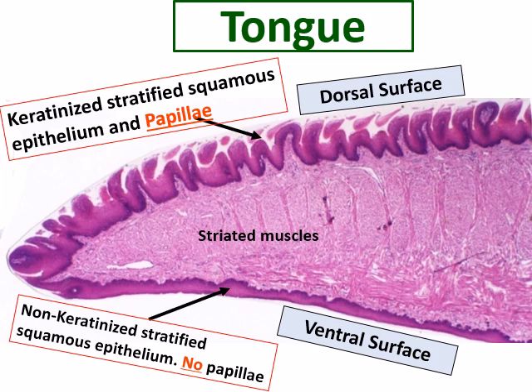The second slide is the tongue. One side is covered with keratinized stratified squamous epithelium in raised papillae. This is the papillae, which is raised epithelium and underlying lamina propria or connective tissue, present at the dorsum of the tongue. Here is the muscle directed in different directions, and the mucous membrane, non-keratinized stratified squamous epithelium, on the ventral surface. Again, there are glands near the ventral surface.